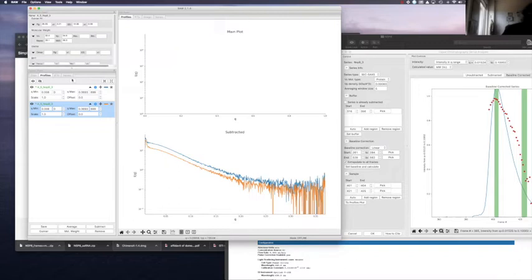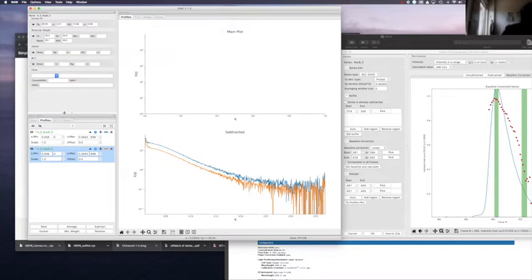And if you want to compare the values that you just did, you can just click on those files here, and you see the Rgs here, molecular weights down here, and same for Rgs here, they drop a little bit, molecular weights are dropping as well for this shoulder. You've got some idea about how this behaves.